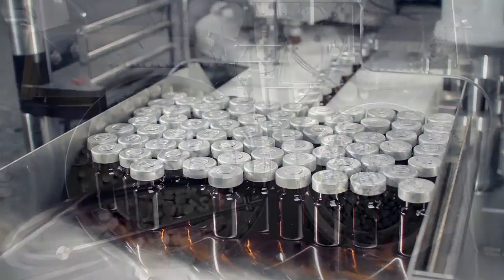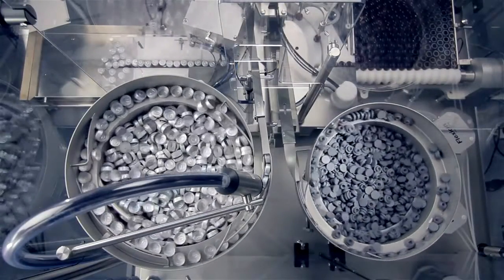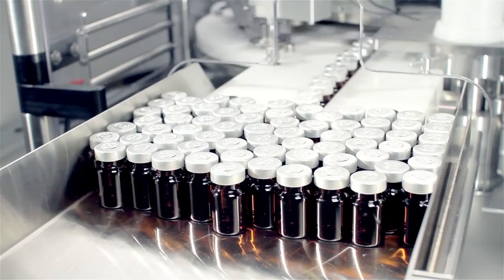Production costs are minimized as just one operator is required to feed the machine with vials, stoppers and caps and remove the final product from the outfeed.